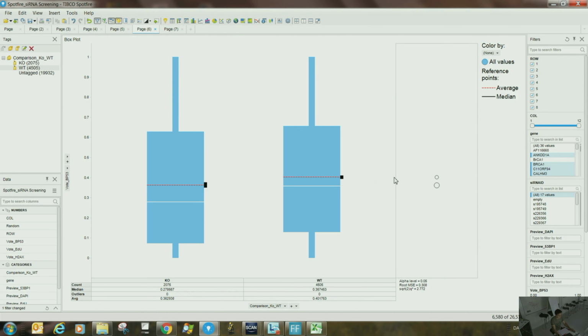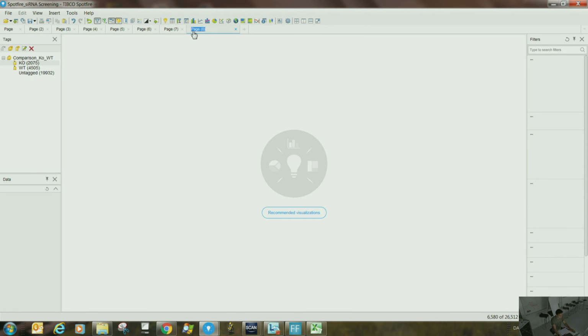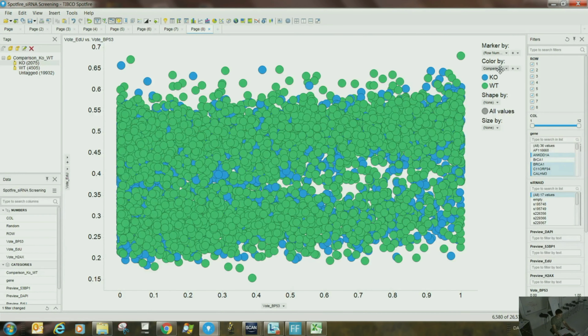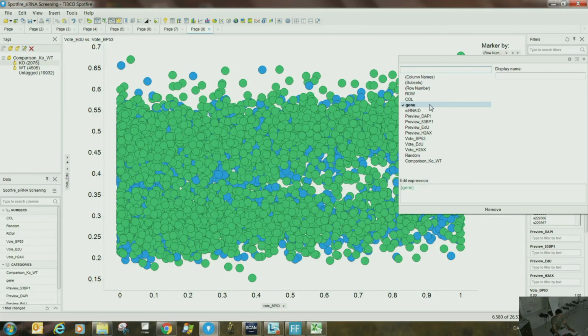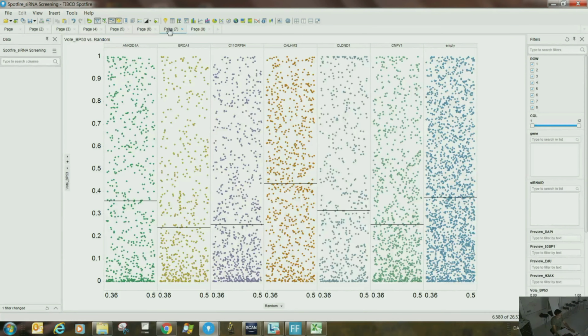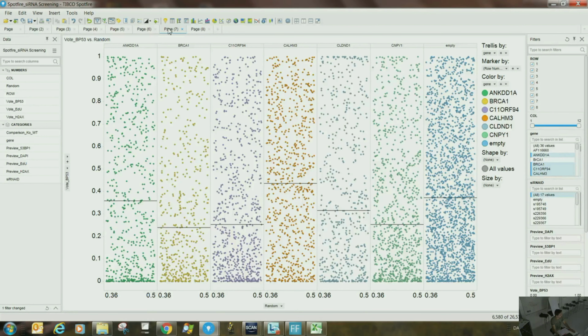This is one part. Very important is that we have selected a few of the genes, we haven't selected all of them. If I go to the other page and try to use, let's say, a scatter plot based on particular genes, I am only restricted to the gene that I selected in the previous page, which is actually not good. What if I want two separate filters for two separate pages? So the question is, is it possible to have a multiple filtering scheme for two different pages?